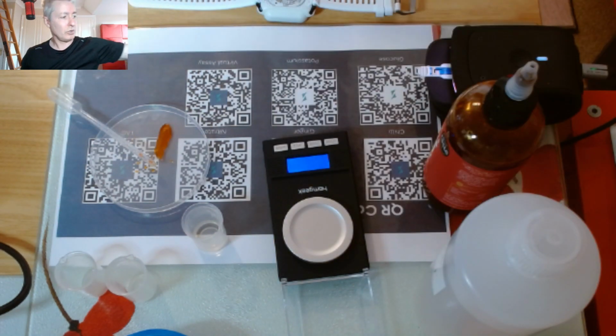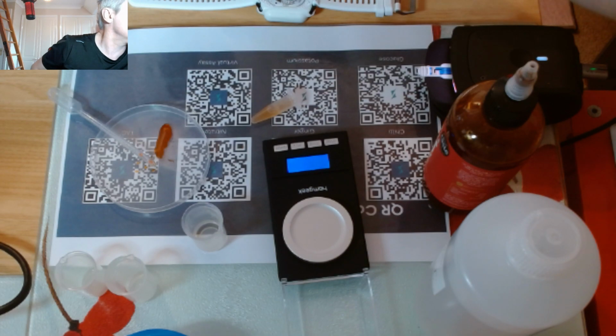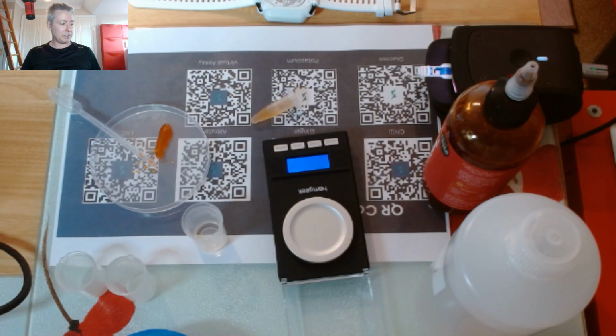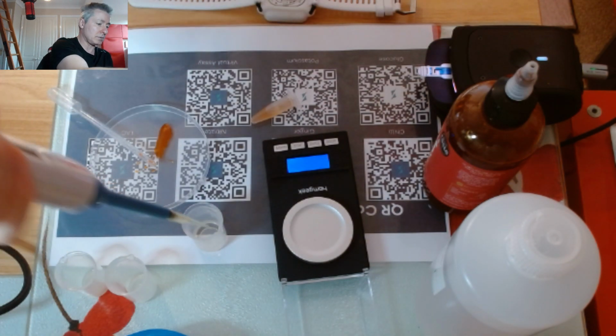Alright. It's not as worked up as I would necessarily want, but I wanted to do it in real time. I don't really need a clean pipette, I'm just trying to demonstrate quite quickly, but I'll put a clean pipette on. What I'm now going to do is put 50 microliters onto the sensor, which is what I'm doing now.